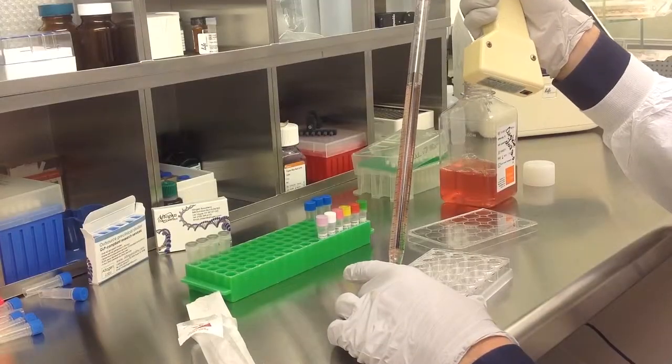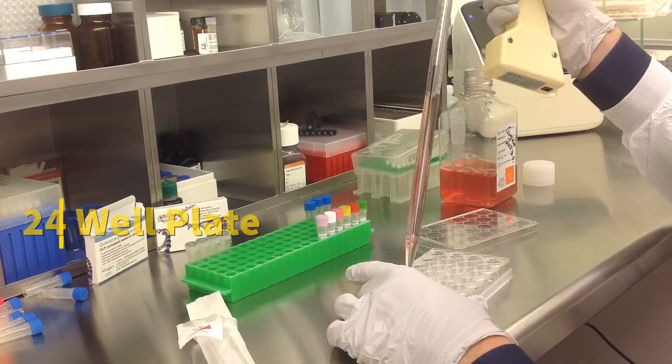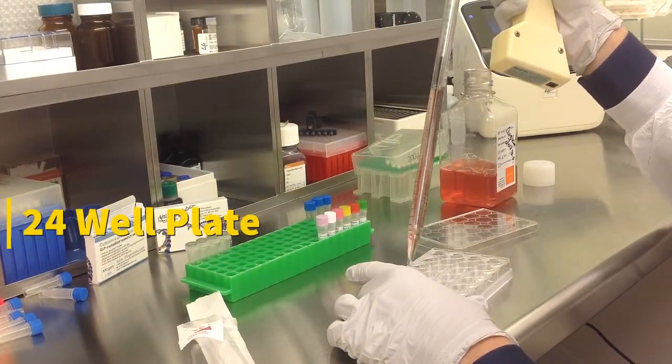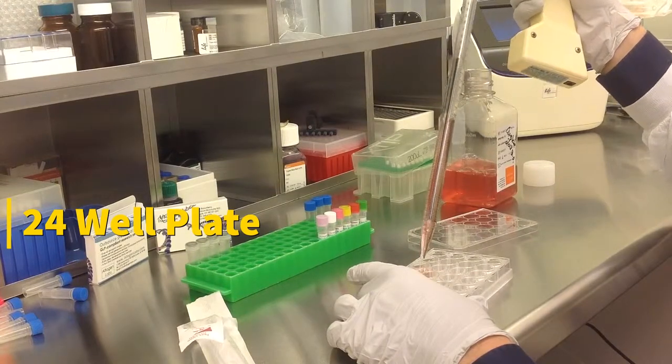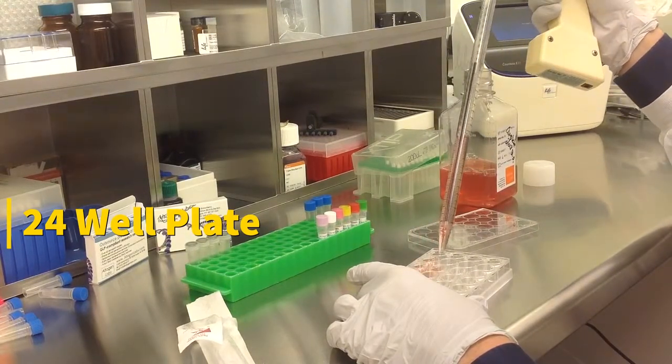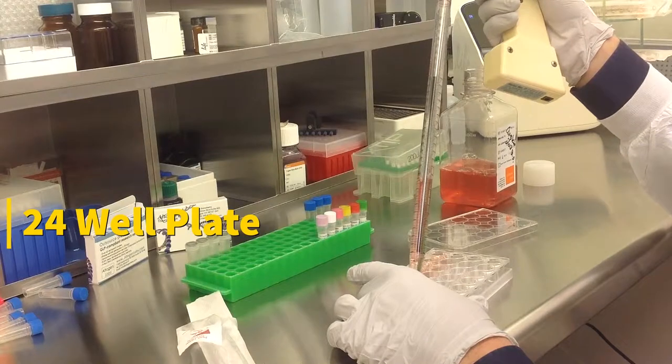Today we will be transfecting B16F10 cells obtained from ATCC. We will be using a B16F10 transfection kit manufactured by Altogen Biosystems. In this tutorial, we use a 24-well plate. Transfections can be scaled up or down based on plate surface area as described in the corresponding transfection protocol, which can be found at altogen.com.